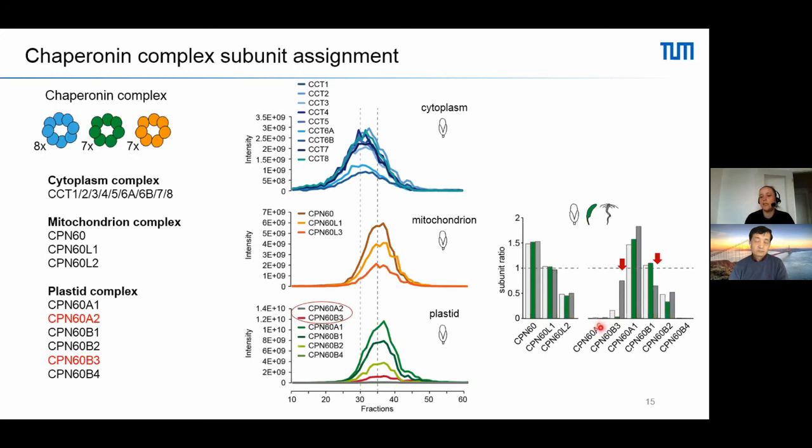So we could not see a striking intensity in root here, but it might also be possible that it's just part of a different chloroplast, a different plastid type, and this is the reason why the intensity profile does not match the typical chloroplast profile that we would expect in the tissue map.